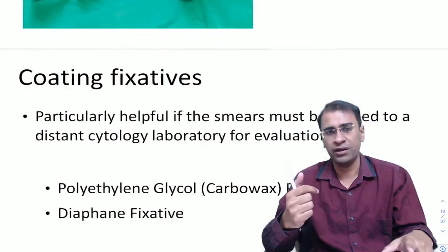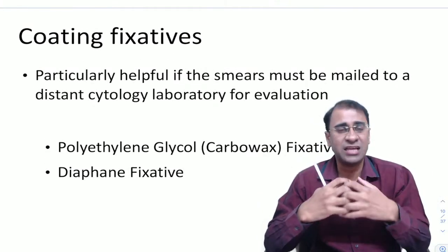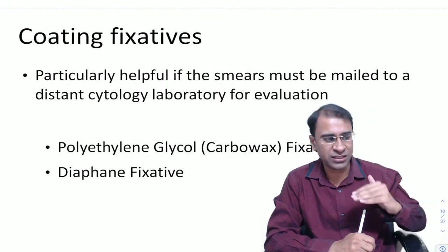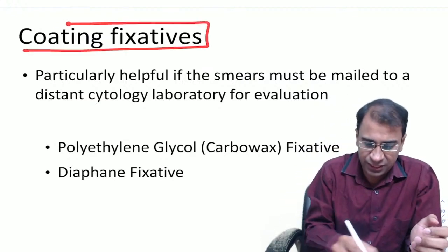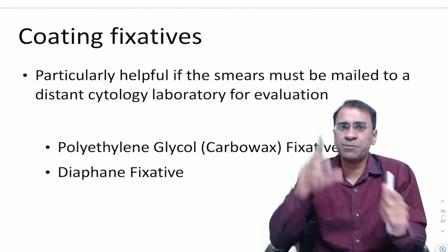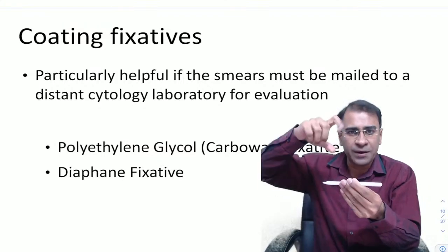So let's move forward with something new. This can definitely be asked, especially in the COVID scenario. Suppose you want to transport a slide from one city to another city. Can you use something? Yes, you can use something called coating fixatives. The coating fixatives are just like a spray, like a deodorant. Similarly, you have a slide and you can spray it on the slide.